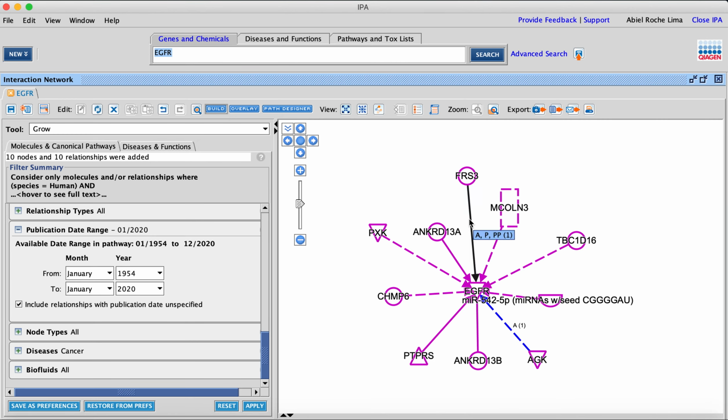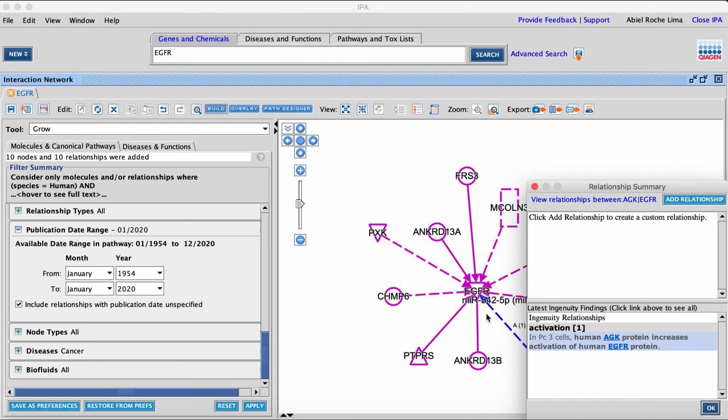So if we click all of them, let's say that all of these are clickable. Let's say that I can click this again. If I click this, inside that edge is this annotation. So I have the same type of data for each edge of this network. And this is the annotation and the type of annotation it represents.